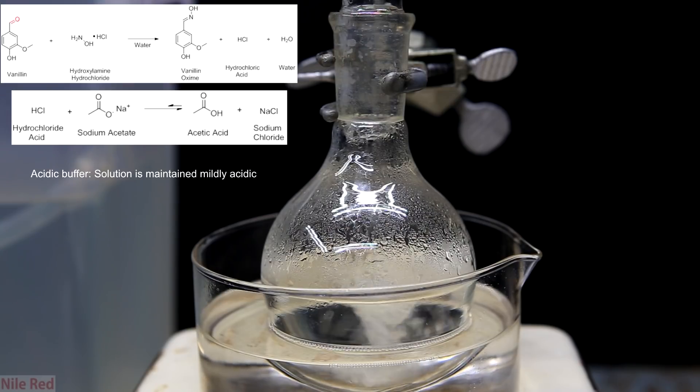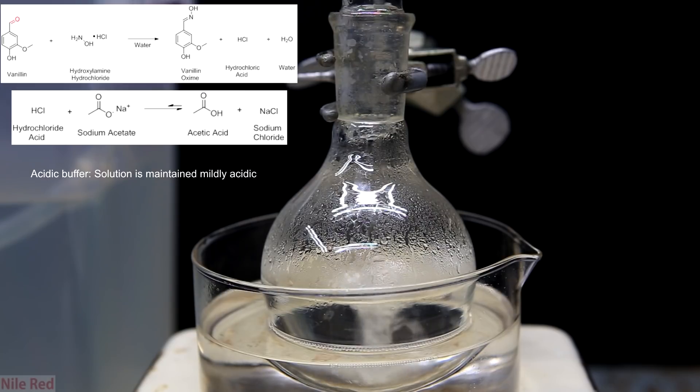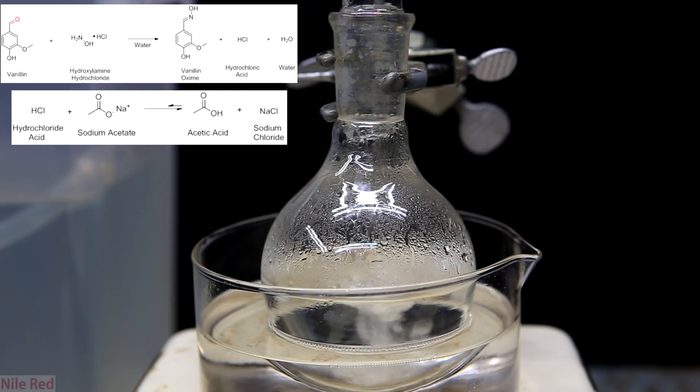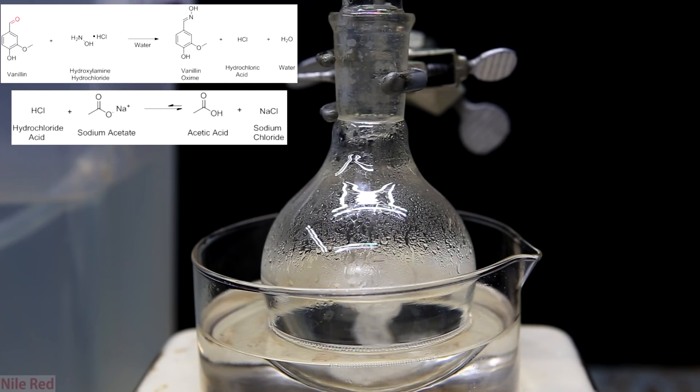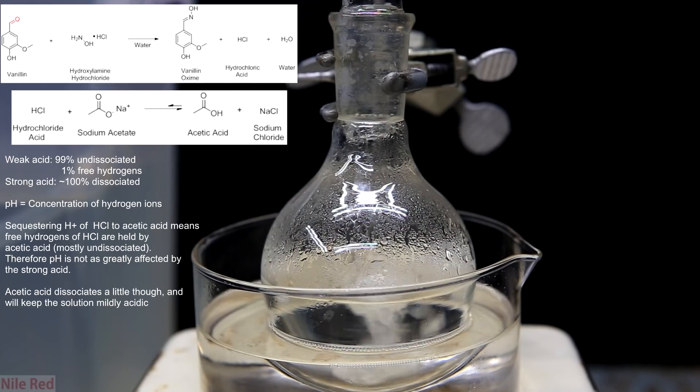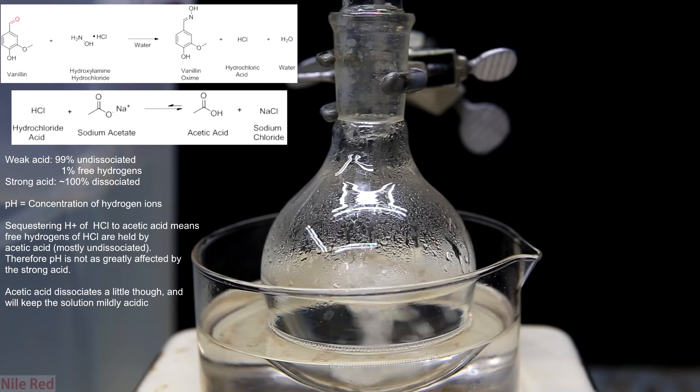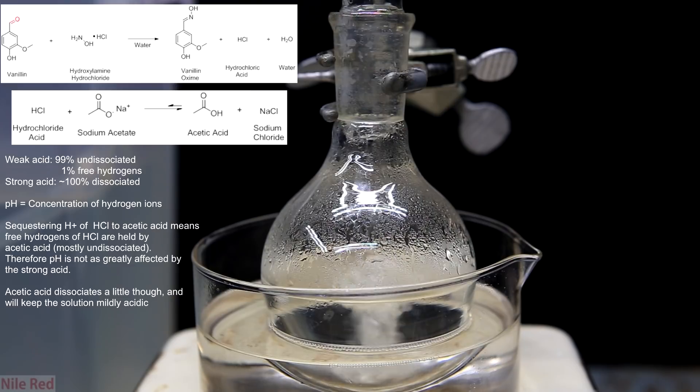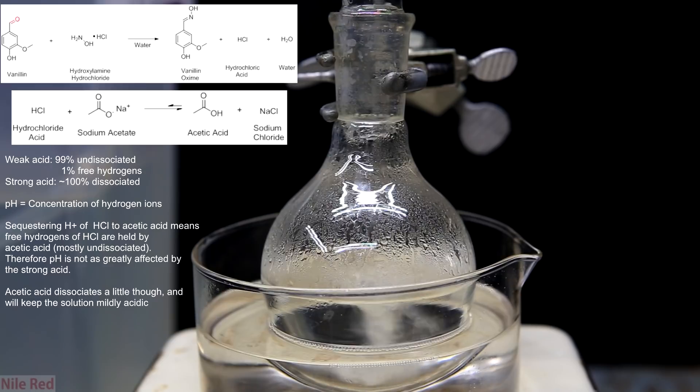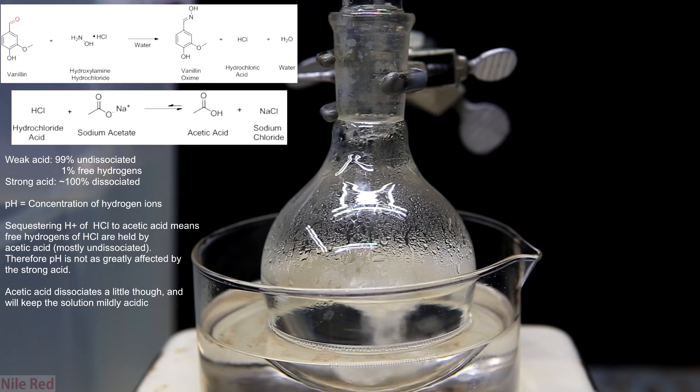I won't really go into the details on exactly how a buffer solution works but it basically resists pH change. In the case of sodium acetate it will react with free hydrogen ions from the hydrochloric acid and it will sequester it into acetic acid. Acetic acid is a weak acid and it likes to hold on to its hydrogens so it pretty much just picks up the extra hydrogens that form, sequesters it into acetic acid and prevents the pH from decreasing. This way the pH remains more or less fixed during the reaction and we don't have strong hydrochloric acid floating around.